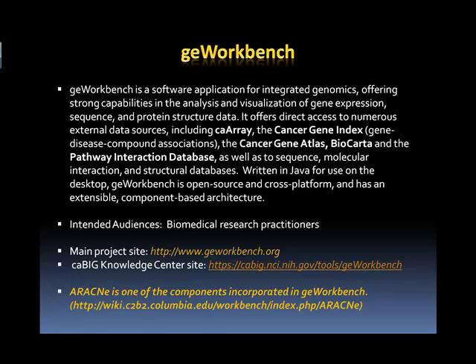So as mentioned at the beginning, this video is focused on demonstrating how to set up and run ARACNe in geWorkbench. We will use a small set of sample data and take you through how to load data, set parameters, run analysis, and view the result.